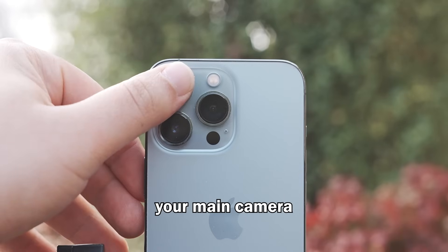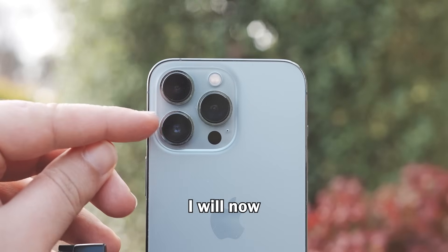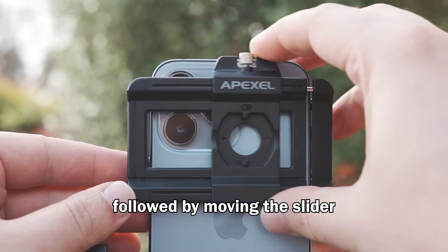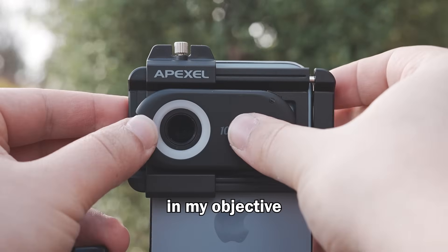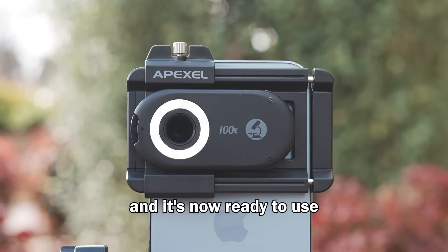You need to find your main camera on your mobile device — for me, it's this one here. I will now attach the stretch clip to my phone, followed by moving the slider until it lines up with my main camera lens. It can be used for any smartphone. Once aligned, I can now clip in my objective. To activate the ring light, I simply turn it on, and it's now ready to use.